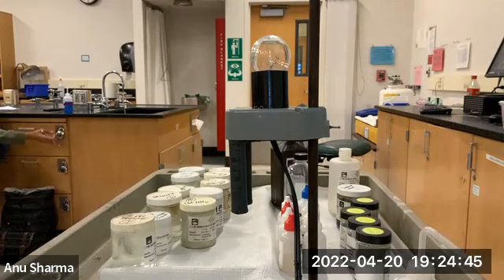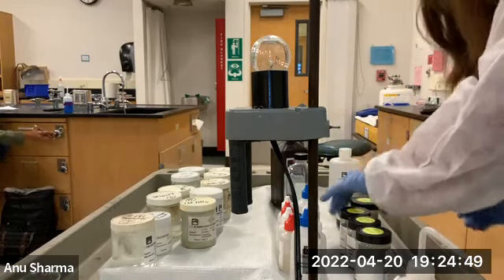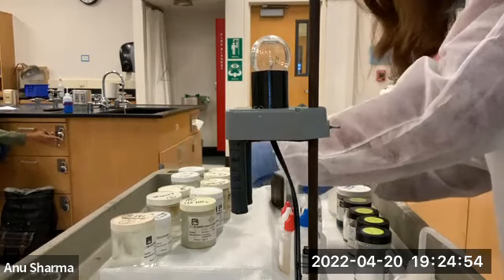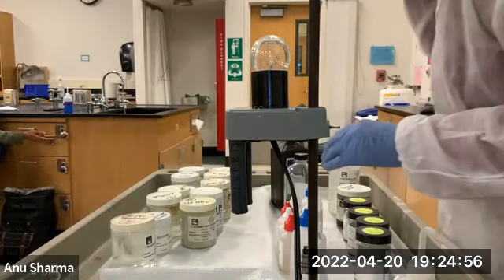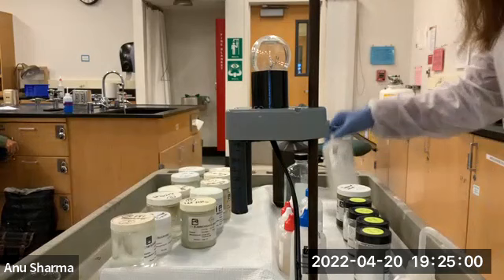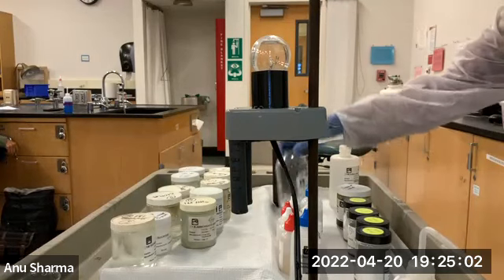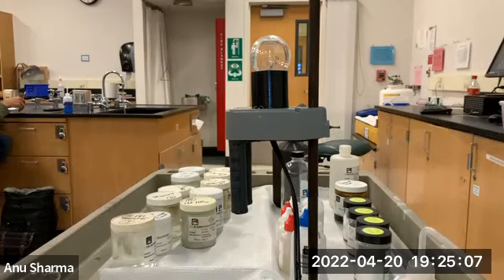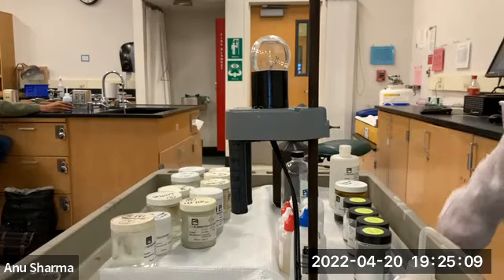Okay, just give me 1 minute. I need to see where's the NaOH. Yeah, okay, I remember it was not there. Okay, hold on to this.